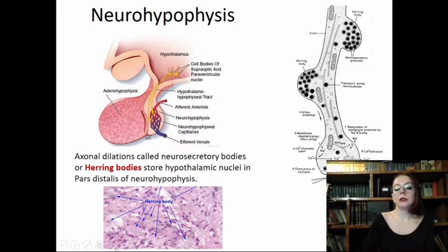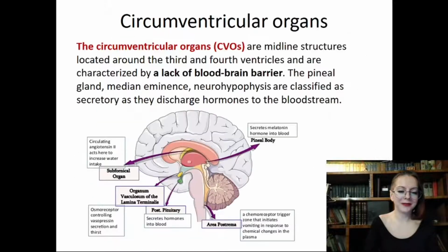Okay, and now what we should highlight, as here we can see the intimate interrelationship between the neuron and the blood vessel. So guess what is absent between them? Which cells are usually present between the neuron and the blood vessel? And those cells are absent here. And if you studied well, you remember that this is exactly the blood-brain barrier made up of astroglial cells. So usually astrocytes are present between the vessel and the neuron, but here in the neurohypophysis, this barrier is absent.